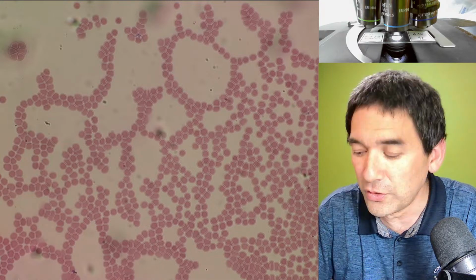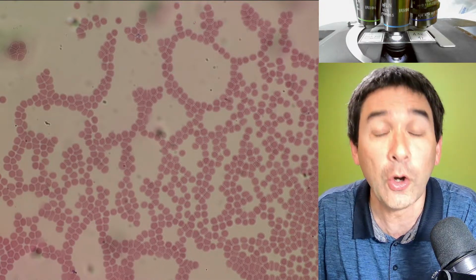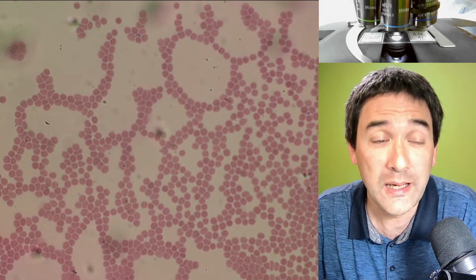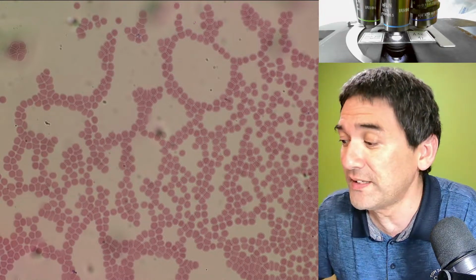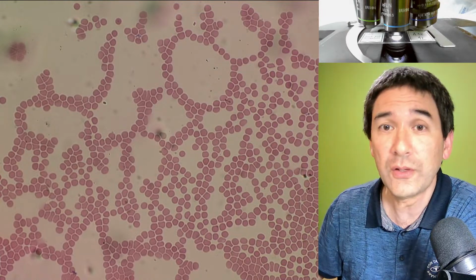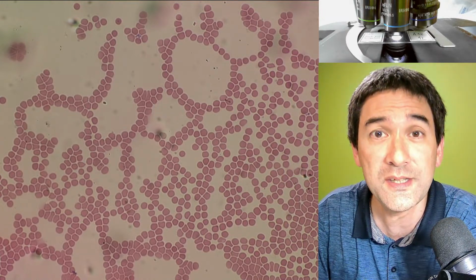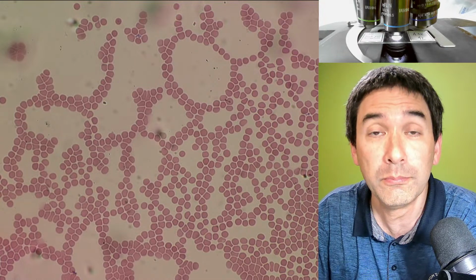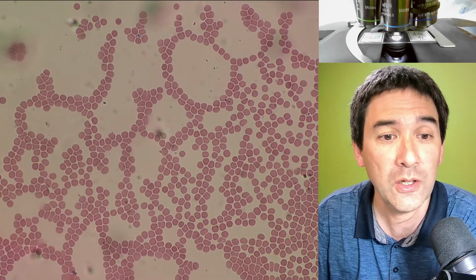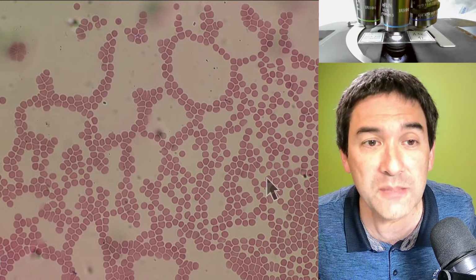But we're going to start off with a couple of permanent slides that I have here of blood, commercial slides. I would like to show you a few of the things that you see here and explain a few of them, okay? What you see here in the background, we're using my 40 times microscope objective. This is a commercial permanent blood smear, as you call it, and what you are able to see here are, of course, the red blood cells. There are a couple of things that I would like to explain here, okay?